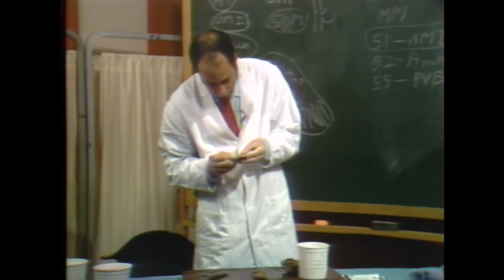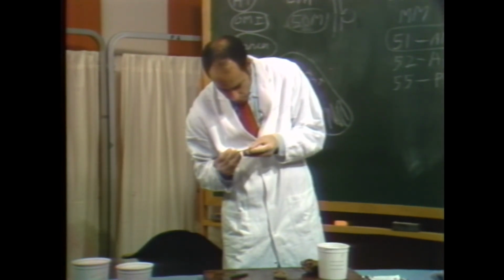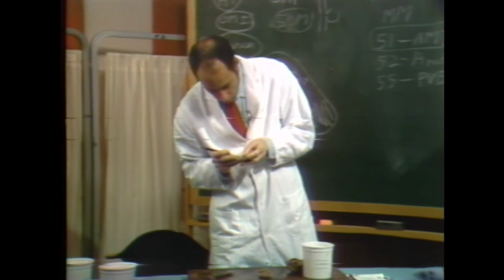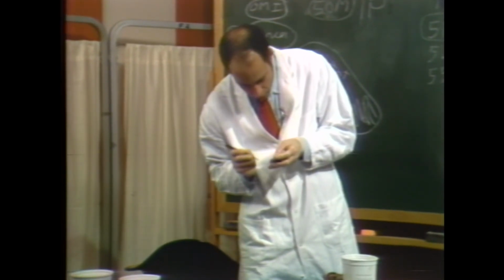Didn't have gas gangrene or something, did he? See, there are pits. There are pits in this muscle here. I thought first they were probably artifacts, but I don't think they are. He didn't have infection, this fella, did he? Yes, he had quite a few bouts of pneumonia.